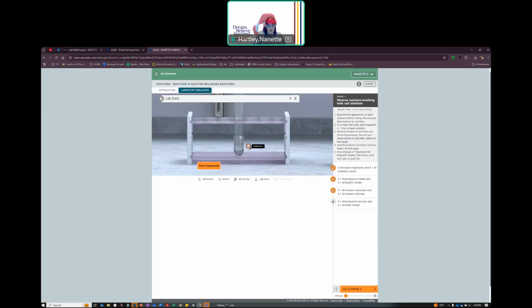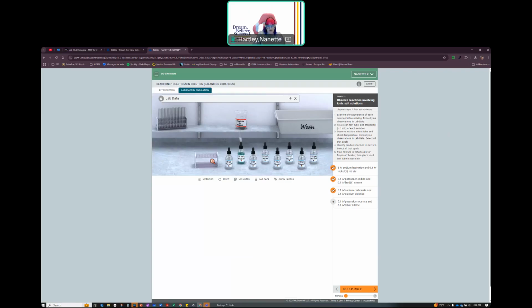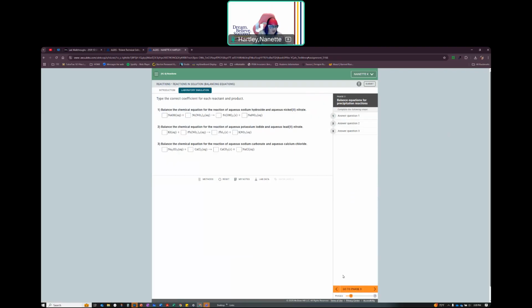Now, I'm going to zoom out. I'm going to dispose of this, pull that out, and then I'm going to go to phase 2. So even though I had potentially the displacement on both of those, there's no reaction that actually occurred.